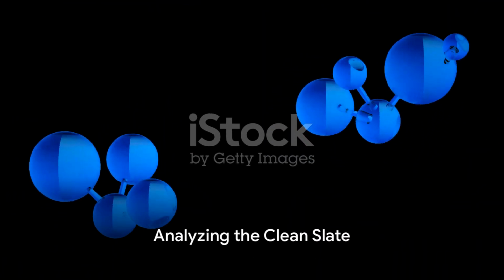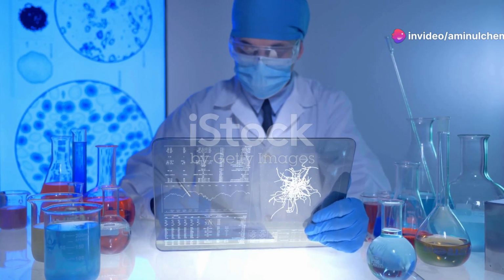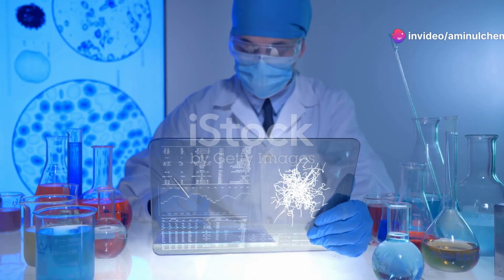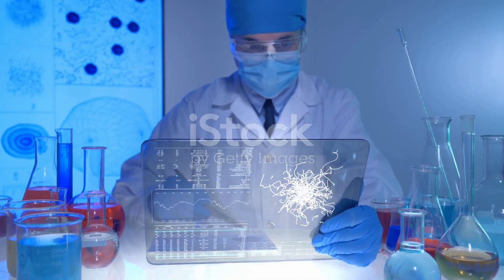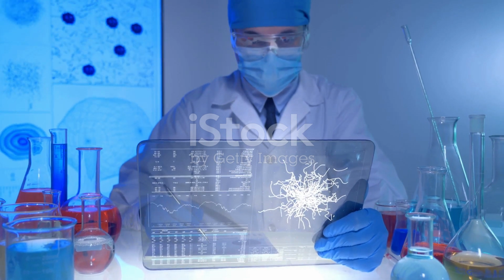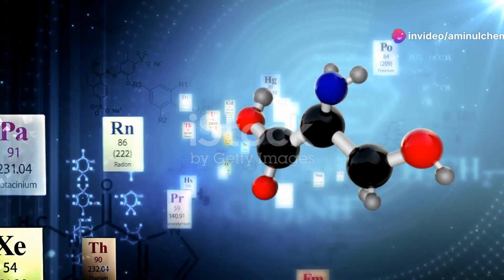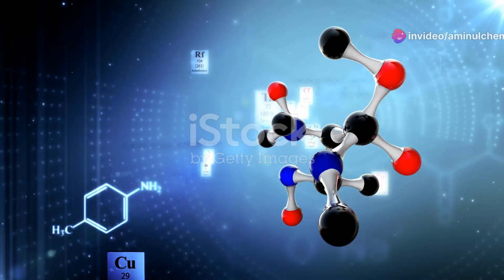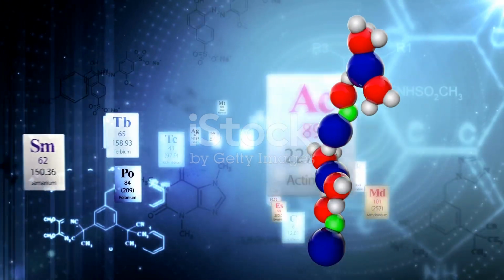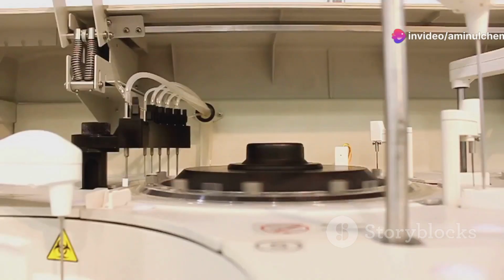Imagine starting with a blank canvas, ready to capture new elements. In the world of FTIR spectroscopy, this canvas is our adsorbent material before it interacts with any substances. Initially, the FTIR spectra of these materials reveal a lot about their untouched state. We see peaks and troughs that map out the inherent functional groups, each one a clue to the molecular dance about to unfold. These baseline spectra are like the opening notes in a symphony, showing us the bonding structures and chemical environment of the adsorbent.